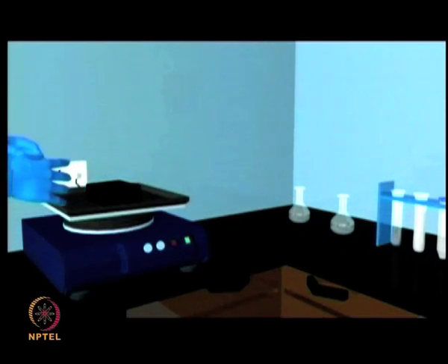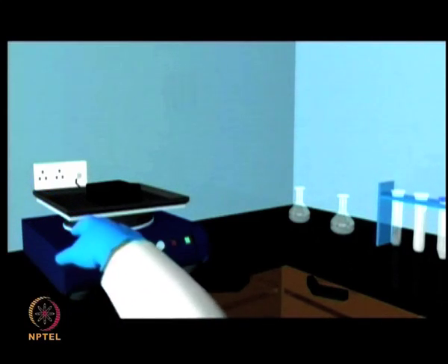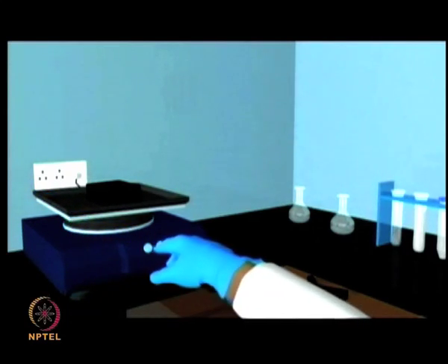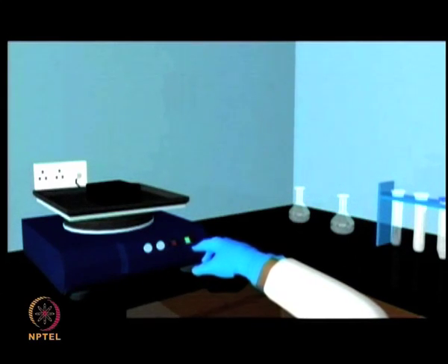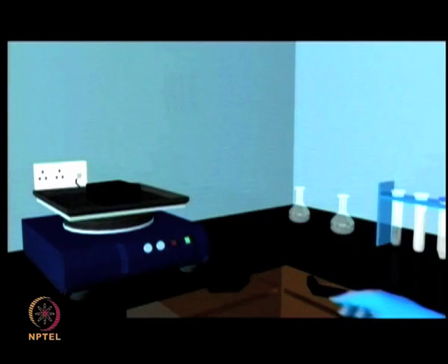While performing the blocking step, make sure to continuously mix the slide, even if you are preparing the entire set. If slides are left sitting on their side without mixing, then they will dry and the slide will appear with a dark background after scanning.